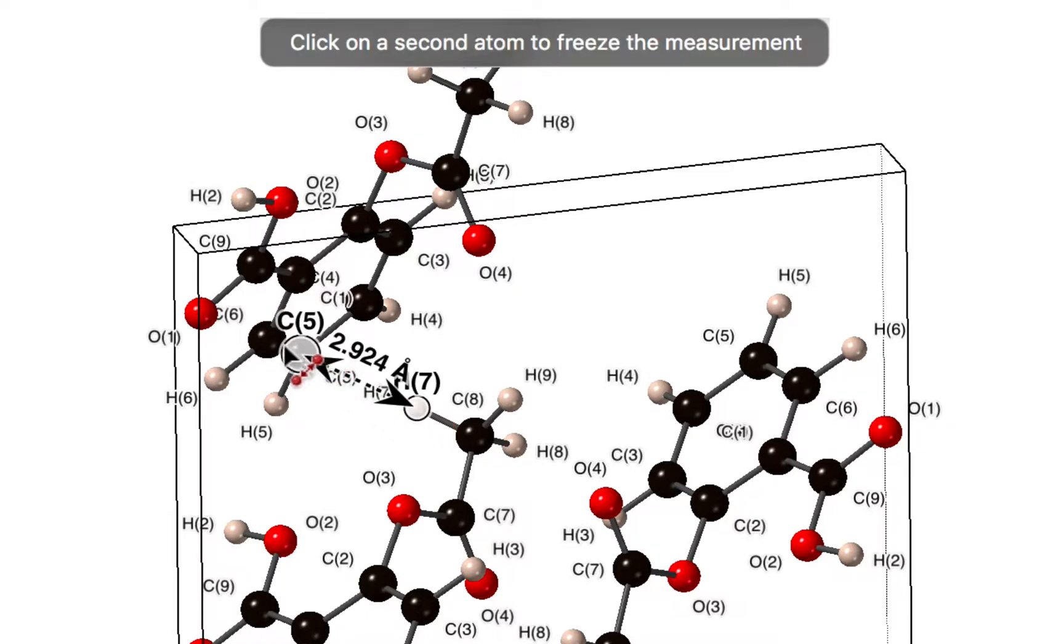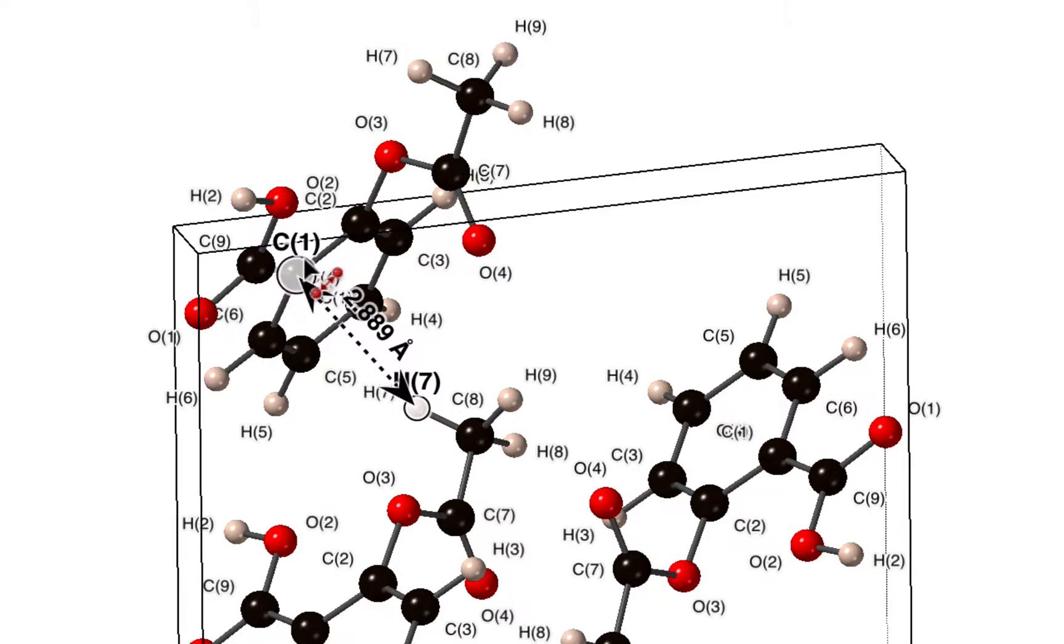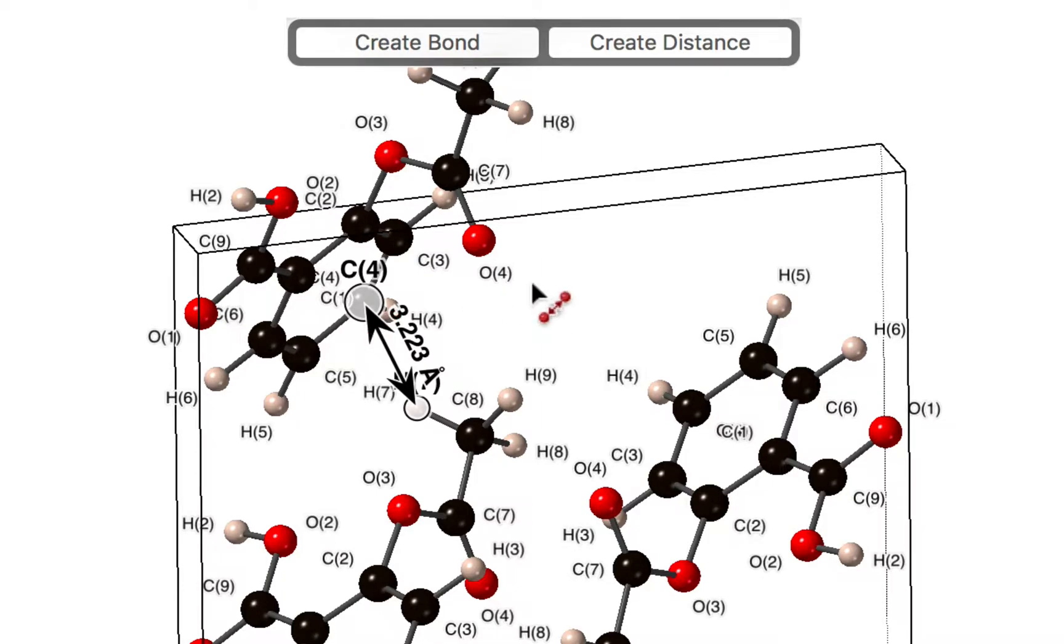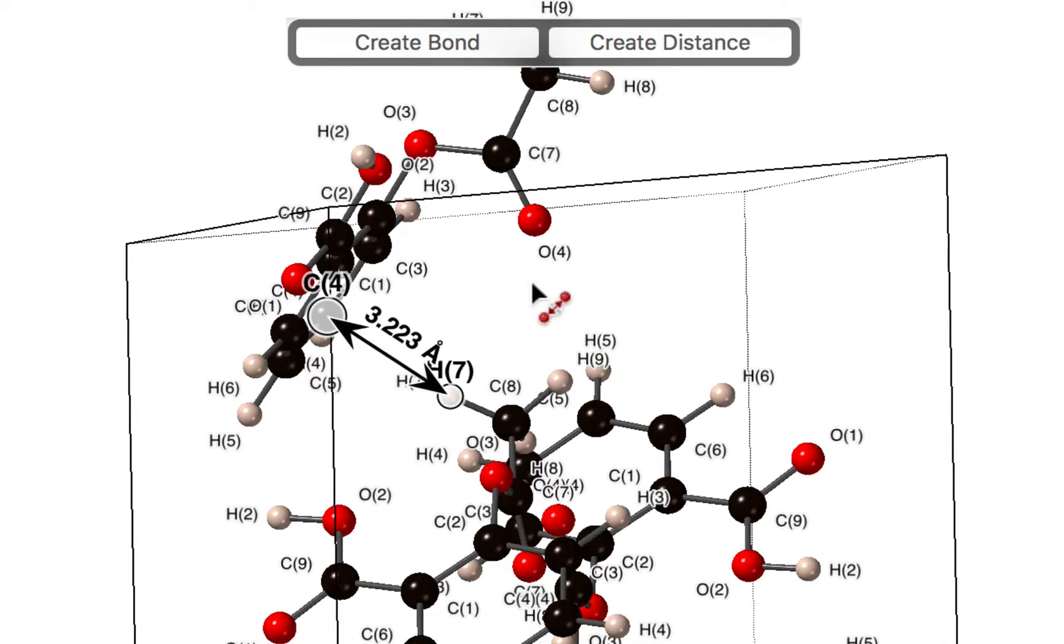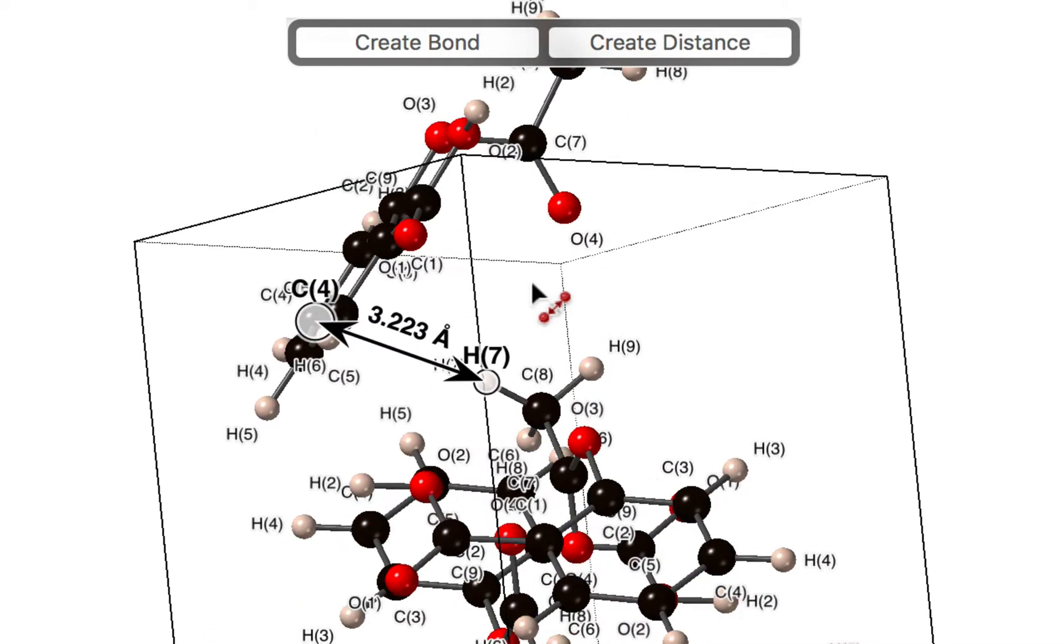We can click on atoms in the plot to anchor them, and then this tool has a rollover mode that lets you interactively measure distances between atoms. If you click again that locks the measurement, and we can rotate the plot and see the measurement that we've made.